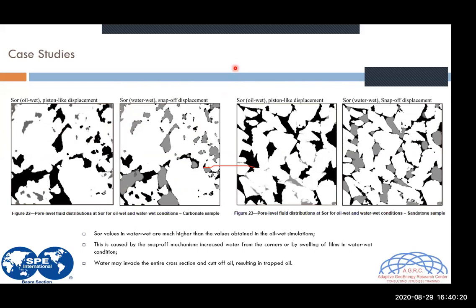And of course, you can identify the thin layer of the fluid that is in your system, and you can try to change the contact angle and the values of IFT as well. So yeah, you can identify, or at least study, several different scenarios and correlate them with your own data.